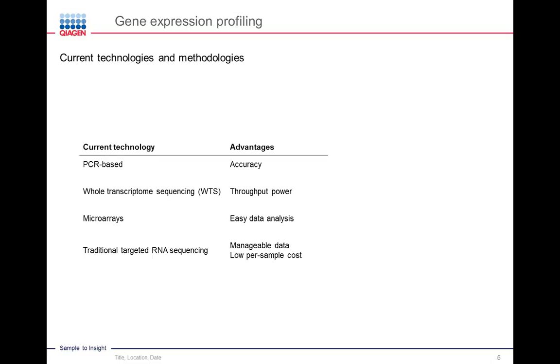Another technology is microarrays. The main advantage is easy data analysis. This is a technology that has existed for a long time, and the data analysis pipelines have been made so easy that anyone can analyze gene expression profiles using microarrays.